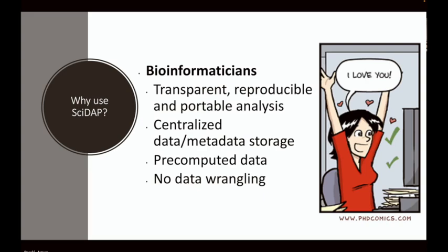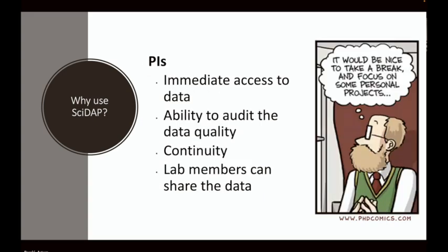And by the way, easy upload to the GEO for your publications. And you don't need to run around with hard drives because the data are centrally deposited. Now for PIs, the advantage is that they get immediate access to data once they're processed. You can browse it. You can audit the quality of the data and how the data were analyzed.